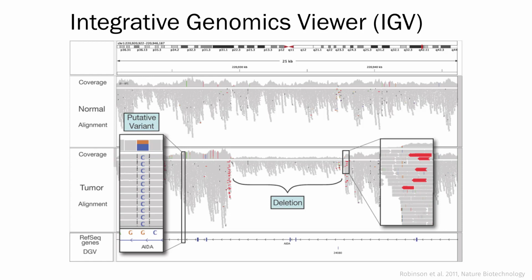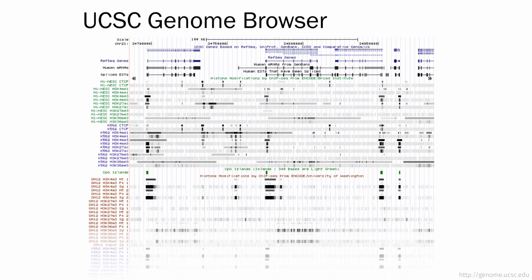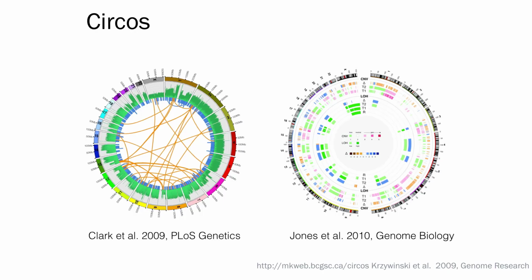So I don't need you to understand any specifics here, but what I want to point out is when we go back and look at Circos, we see a whole genome. Right? That's the whole genome. There's nothing missing really. We have the whole sequence of the genome shown. Of course, what's missing is detail. Right? This is an overview.